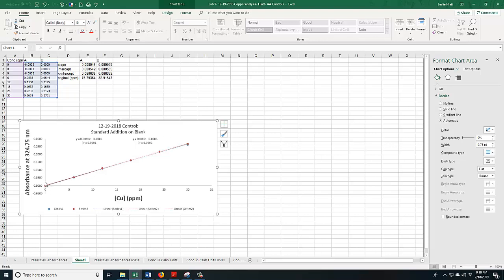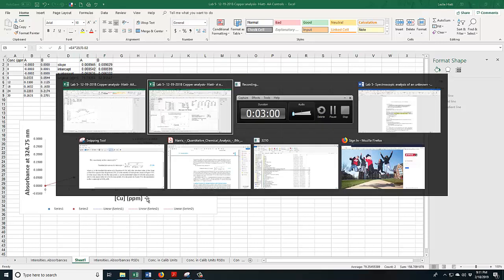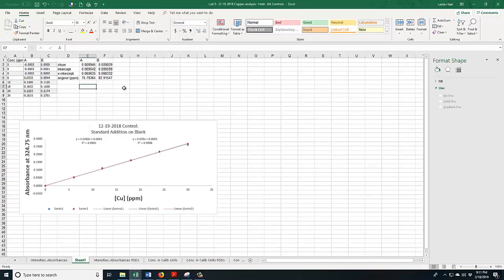When I did standard addition, you notice that the Y here around your 0 is so much smaller. So much smaller, in fact, that whenever I did this with two different types of samples, one I believe was water and one had your zinc and your manganese in it, I got 75.8 and 82.9. So both were intrinsically around 0, much lower than the one where we know there was a definite amount of copper. And our water could have had some copper in it, because glass is really good at absorbing copper and other heavy metals, and so when we put the water in it, we might actually have had a small amount. Probably not that much, but there probably was some residual copper in it.